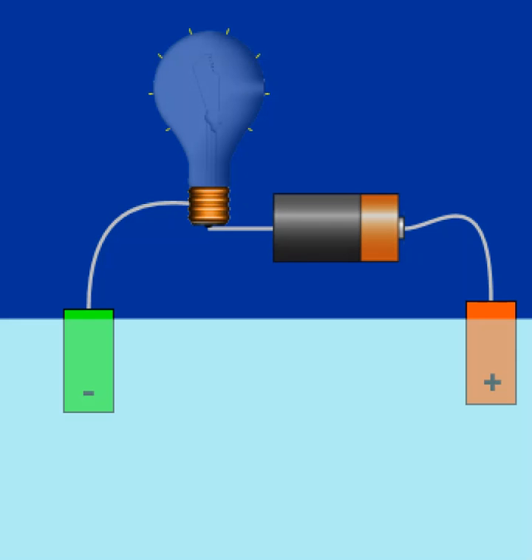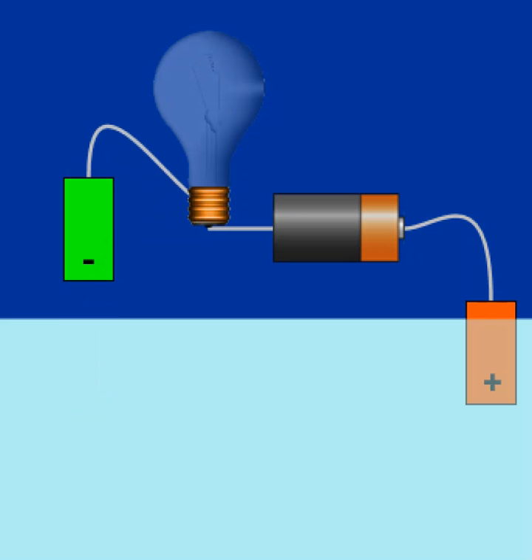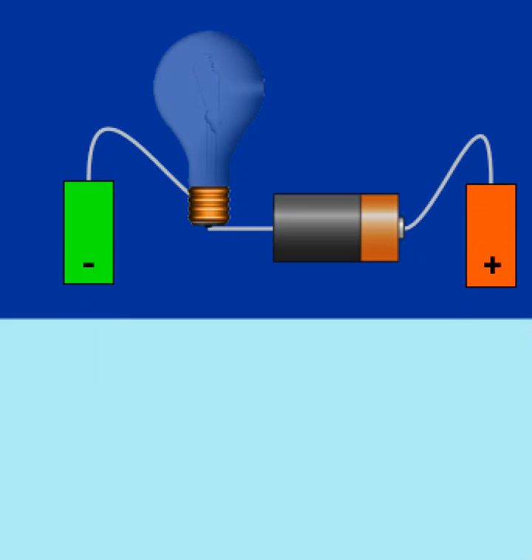So next we're going to try our sodium chloride, and you remember what it looked like when we had sodium chloride dissolving in water, how we got some ions. Now we're going to do 1 molar, that's what that M is, molar sodium chloride, and 0.1 molar sodium chloride. The molar is the concentration, so 0.1 is a more dilute solution, and 1 is the more concentrated. It looks like we're starting with the more concentrated one.